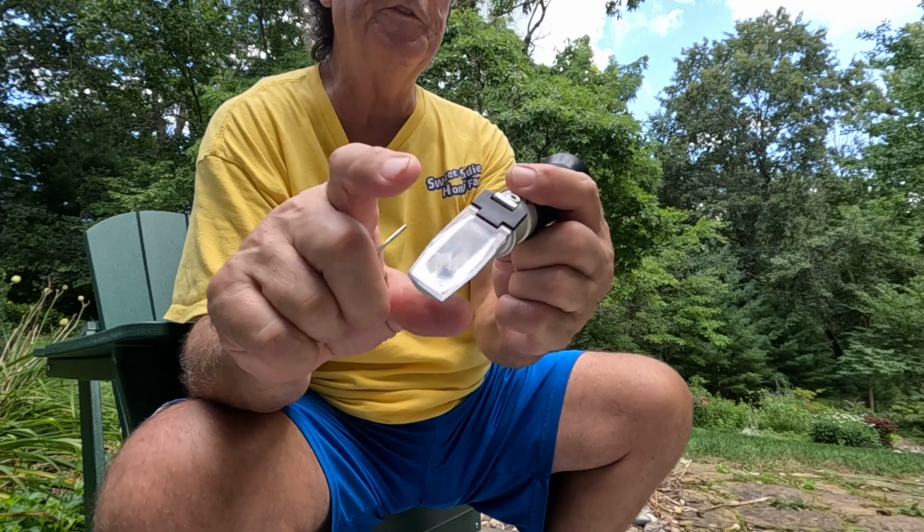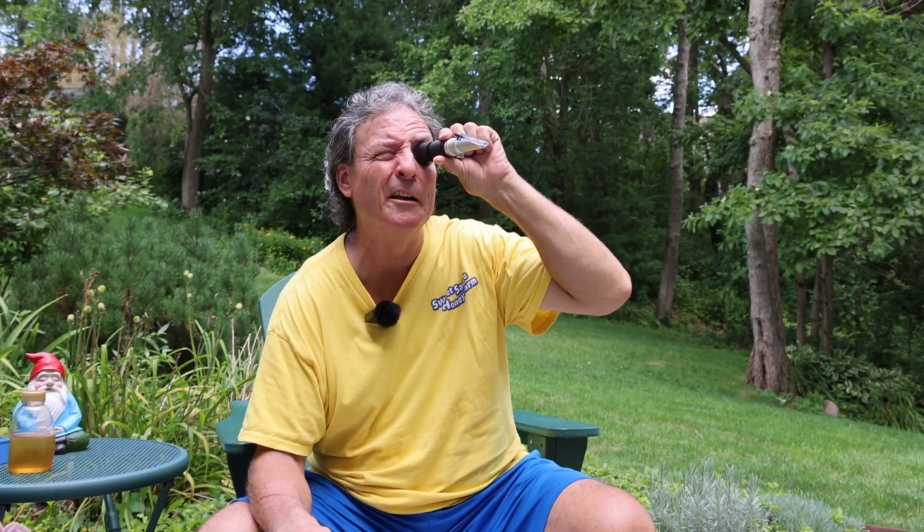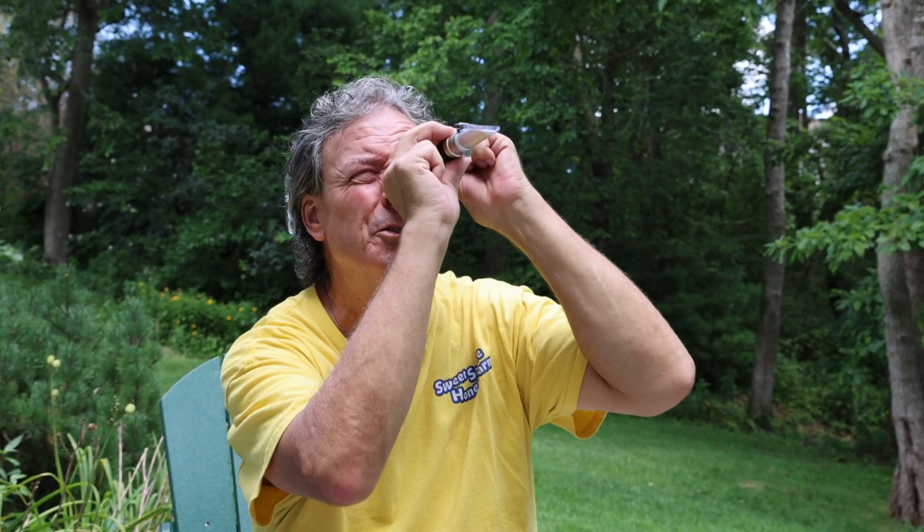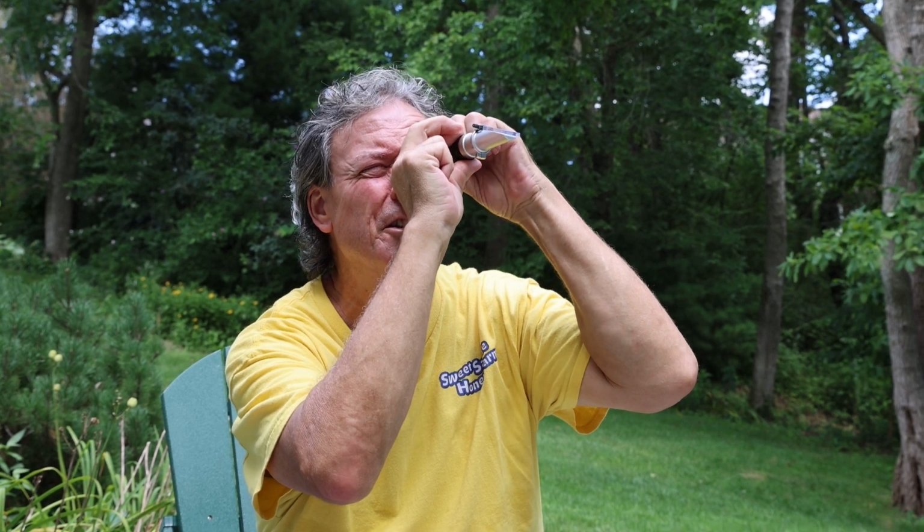And then you hold the refractometer up and you look inside it, and you're going to see that blue screen, okay? And we're going to show you that. On the inside, there are going to be 3 different levels on these. The one you want to pay most attention to when you're calibrating is the BRIX, B-R-I-X level. On this one, it happens to be in the middle, and most I've ever seen it is in the middle. So you focus in on that, and you should have a focus as well, so you can focus your refractometer so it's easier to see. You want your refractometer with the extra virgin olive oil to be between 71 and 72 on the BRIX scale. So basically you set it to 71.5, and it's pretty easy to do.